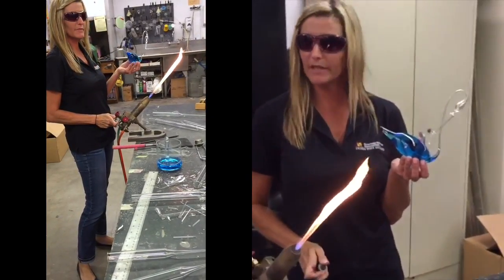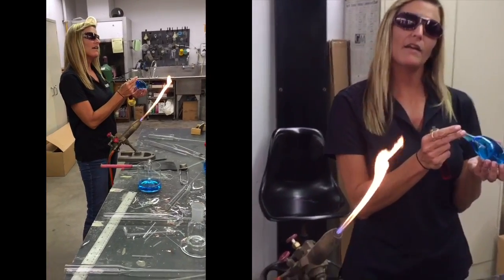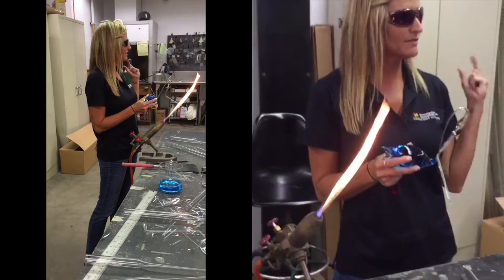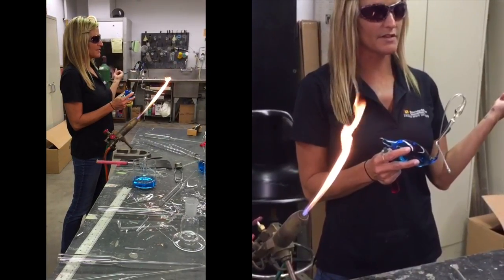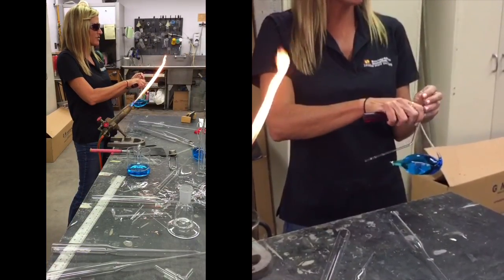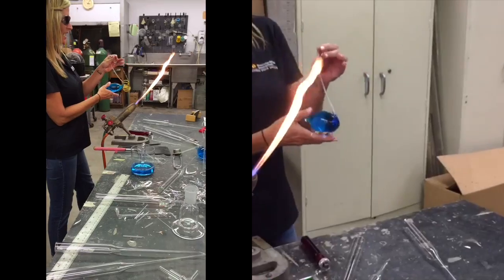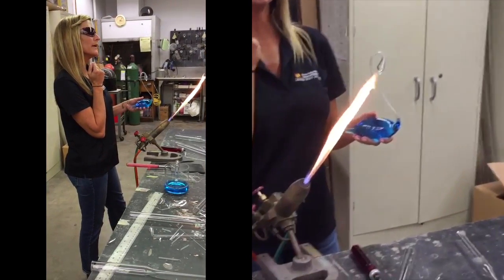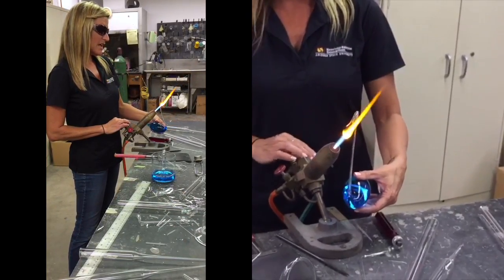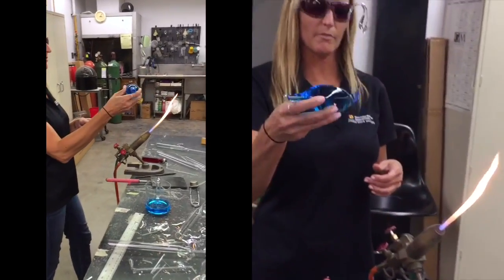Do you guys have any questions? You made it look so easy. Do you know how many other glassblowers there are at universities? It's kind of a dying profession, but U of A has two glassblowers — actually a father and son down there. If a chemistry department has a good grad program, there's usually a glassblower. I belong to the American Scientific Glassblower Society — at the last meeting in May, there were probably 300 or 400 people, scientific glassblowers from all over the world. There's not a lot of women in scientific glassblowing. I just polished the end and left it open so it's not sharp.